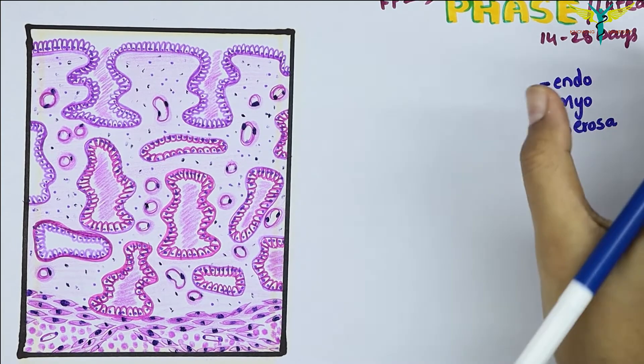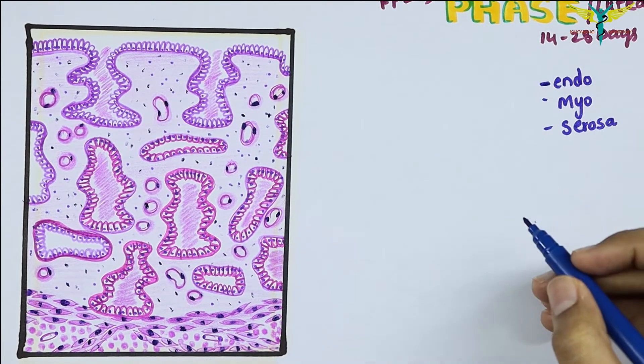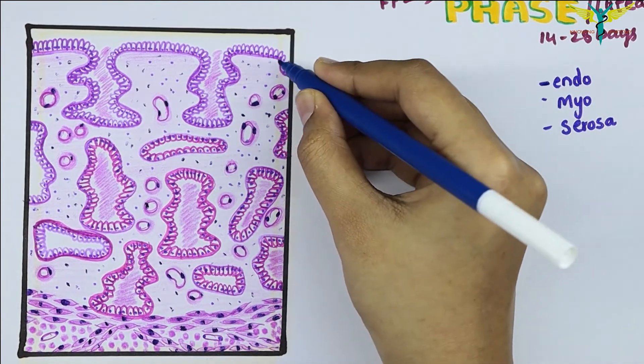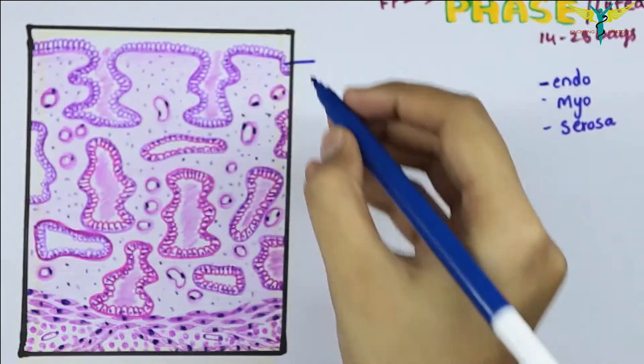The thickness of this endometrium or the mucosal membrane is very much increased in this secretory phase. This is the lining epithelium, which is the columnar epithelium.